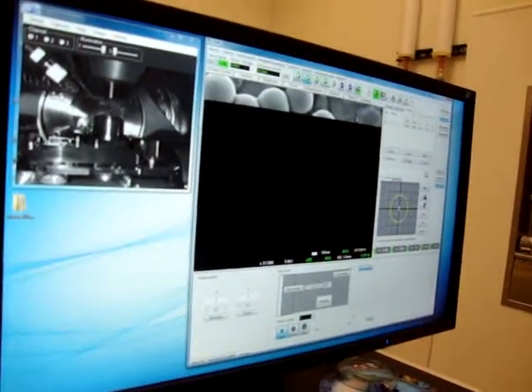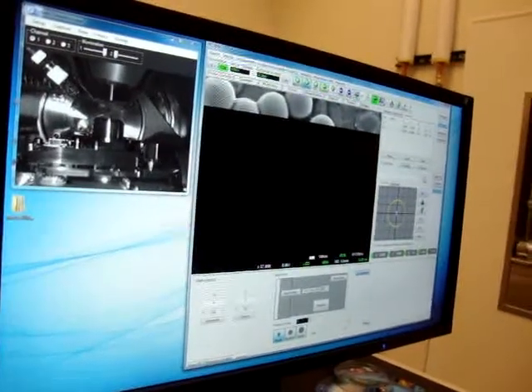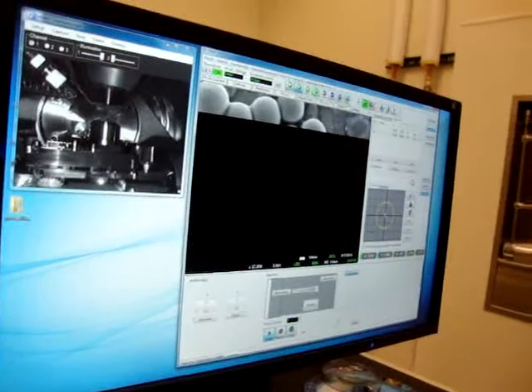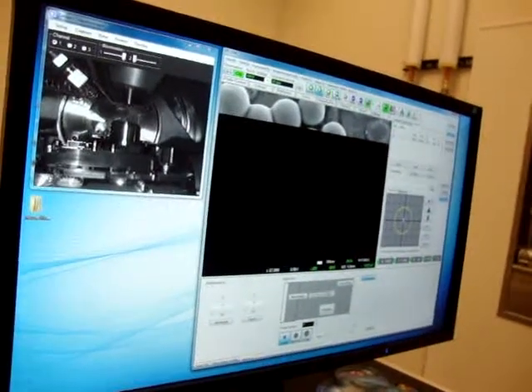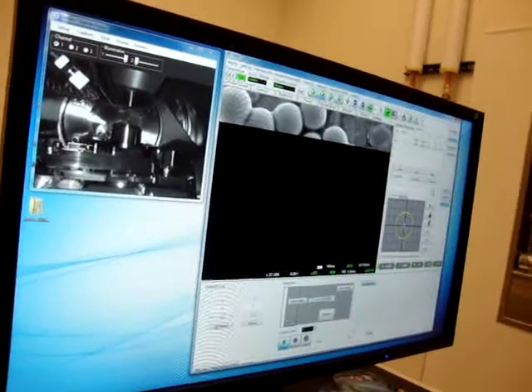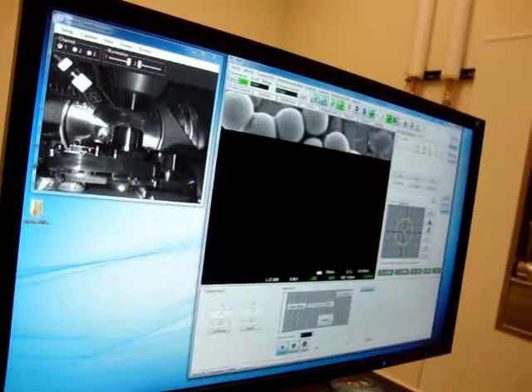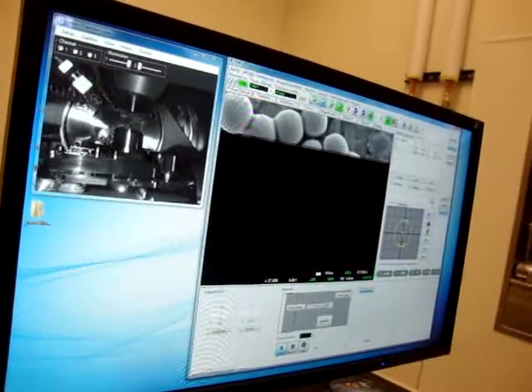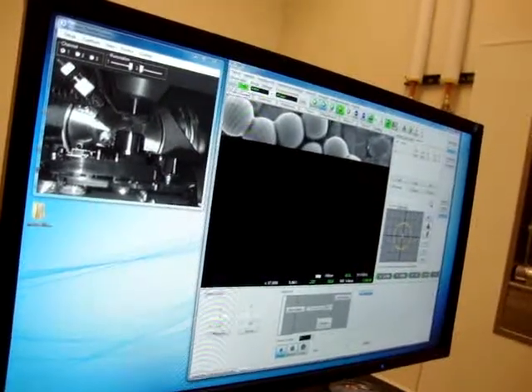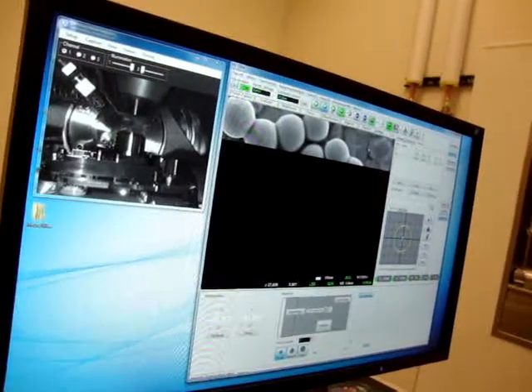Then you have what's also called recipes. I saw it somewhere under maintenance. Recipes is you like to run your samples the way you run them. So you can set the scope up to remember you. It's like saving the alignment file in there. Well, alignment file, how you want your kV, all the information that you like, and I can just pull up.